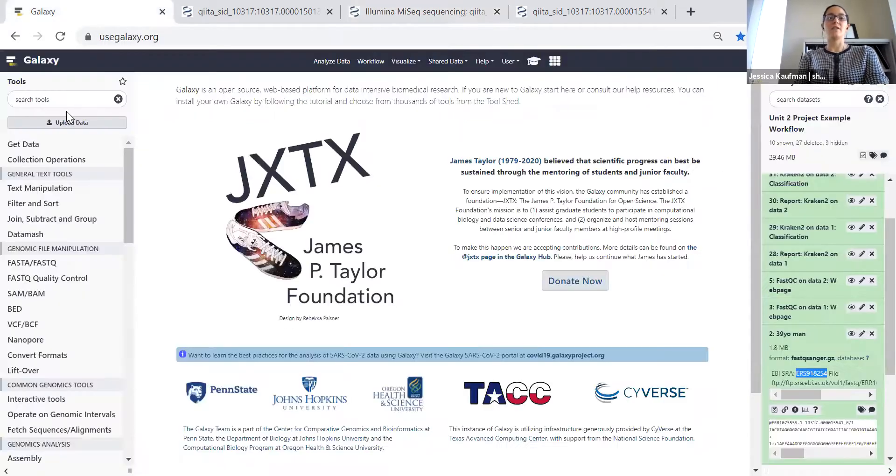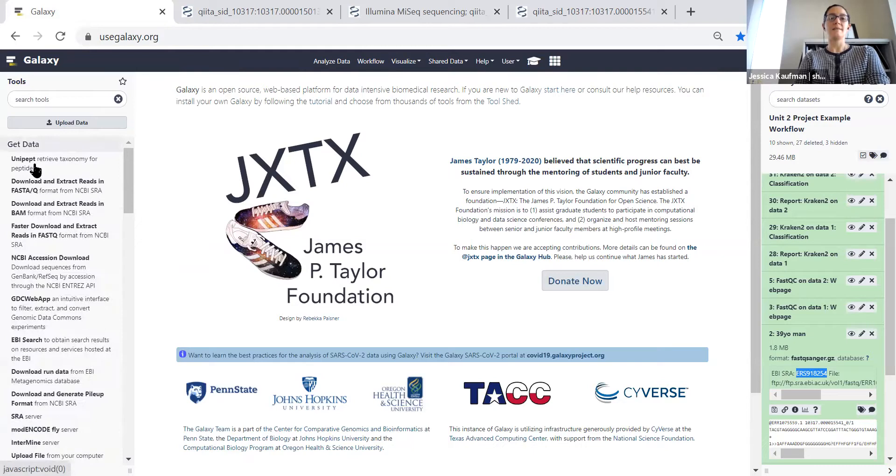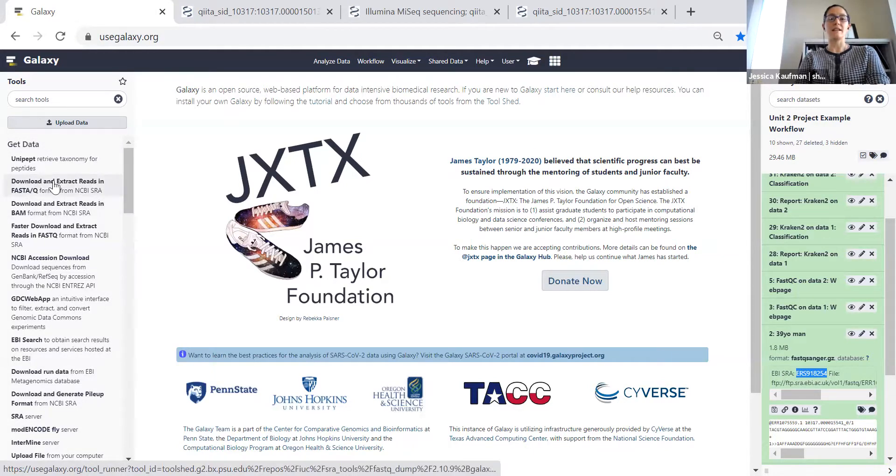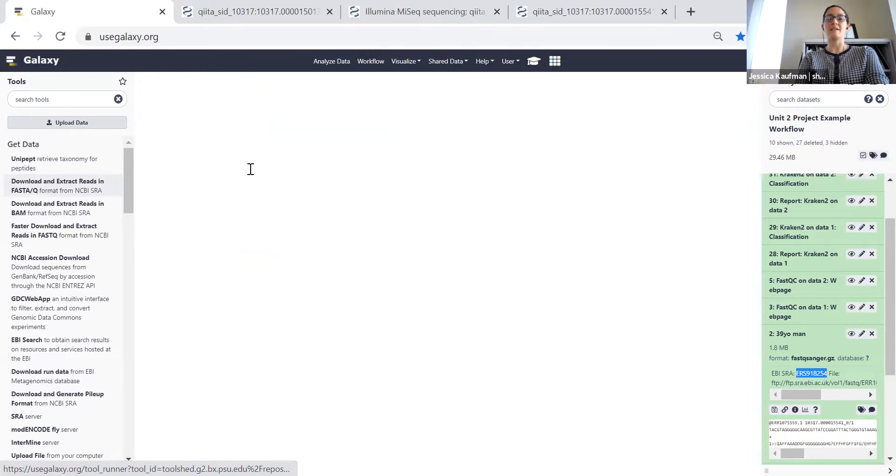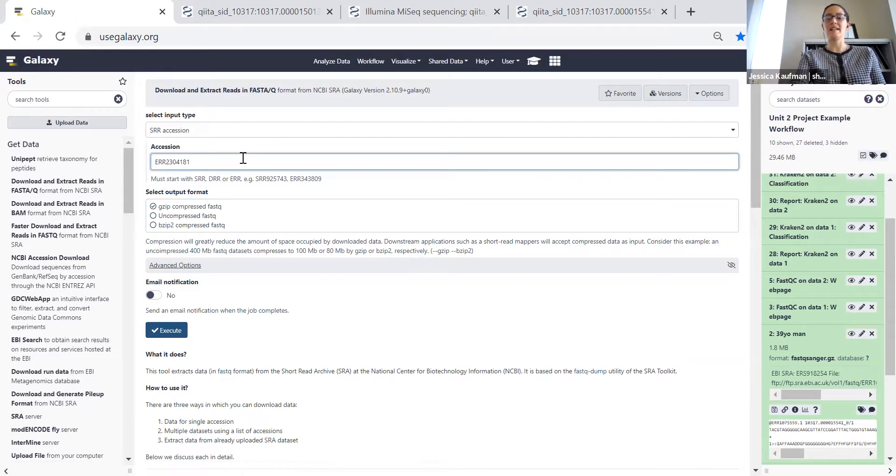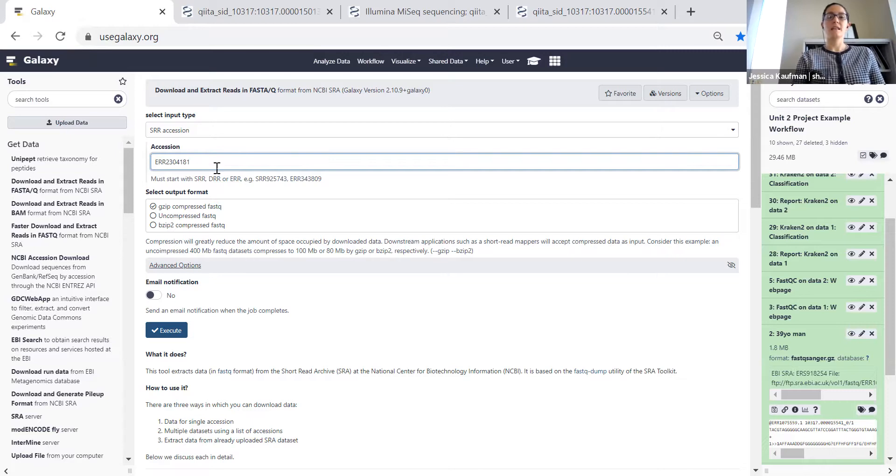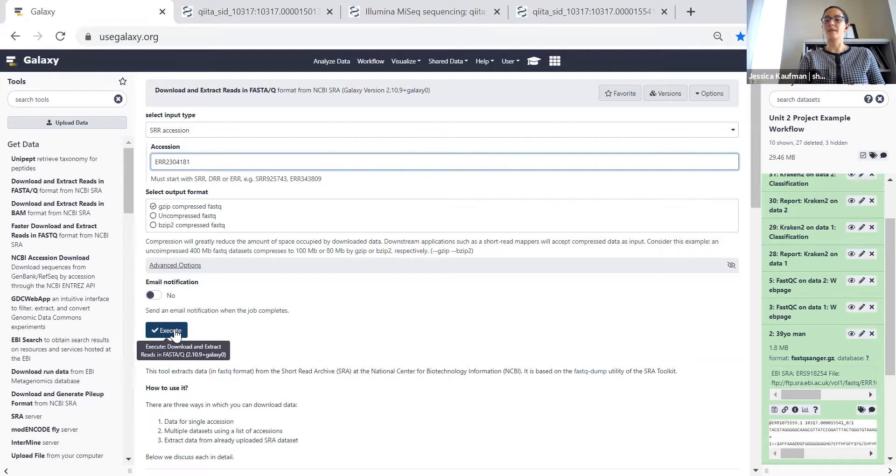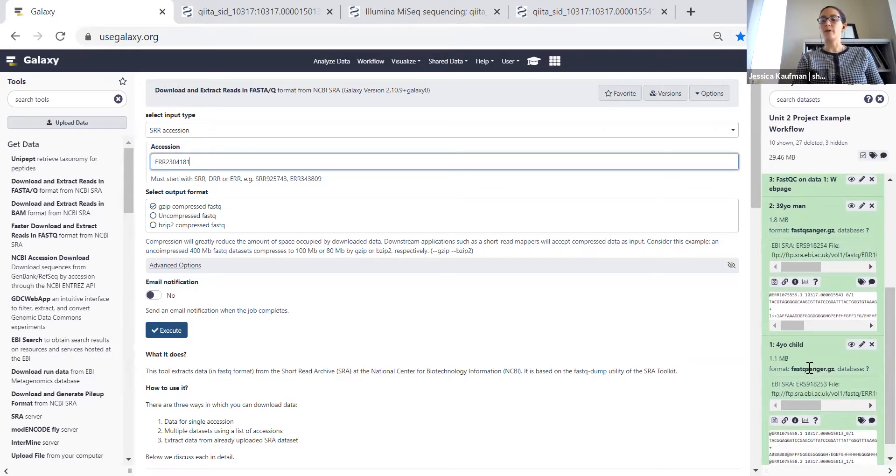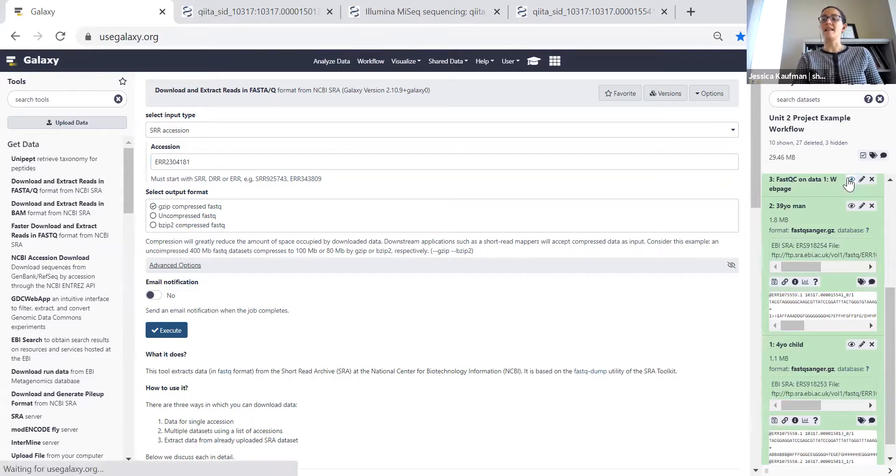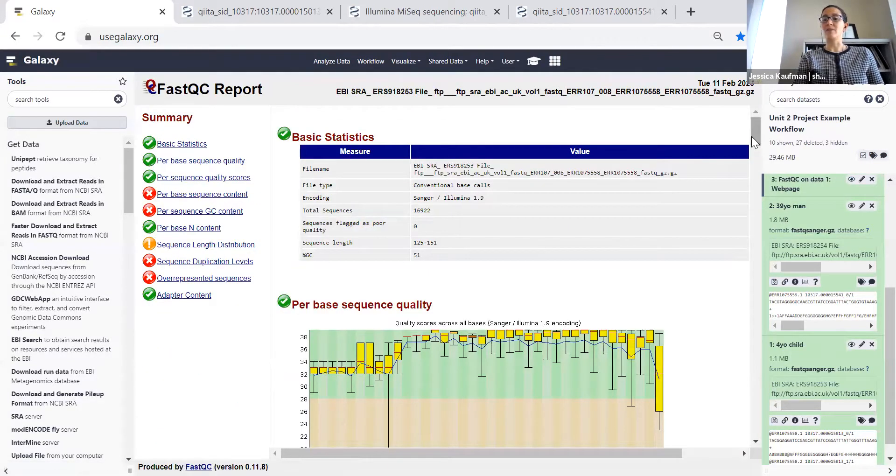Now I can go to Galaxy and get data, download and extract reads in FASTQ format from NCBI SRA. I'm going to paste in that accession number ERR. I want it to come in as a compressed FASTQ file and click execute. I've already done that twice in my history. You can see I've imported the FASTQ file for a four-year-old child and a 38-year-old man. Then the next step is to run the FASTQC report.